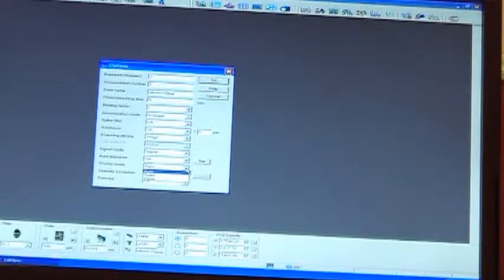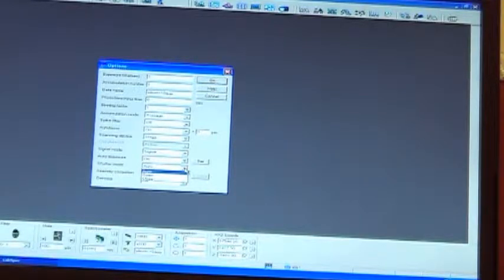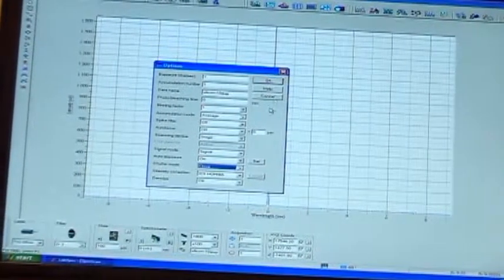If you're trying to acquire data that has really high peaks and you want to acquire at like 1/10 of a second, we recommend you go into options and just hit open. Because the shutters in these systems are really not rated below about 1/2 a second, maybe 0.3 of a second. So if you really want to go to 1/10 of a second, just tell the shutter to open. It'll always keep the shutter open, because the shutter is just a mechanical thing, and the CCD will acquire for the time allotted. There, same thing, shutter mode now, we get it closed.